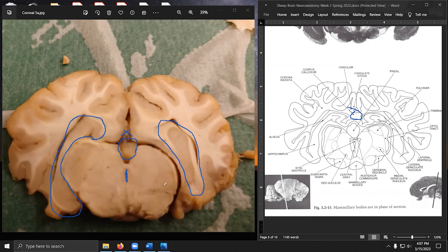Okay, let's go ahead and undo to set that back a bit. We'll undo some of these other drawings here to remove some of the clutter. The optic tract now has receded a decent degree. It would basically be this lighter colored sliver on the exterior of this darker surface. The darker surface, the more lateral parts of it, would be the lateral geniculate nucleus.